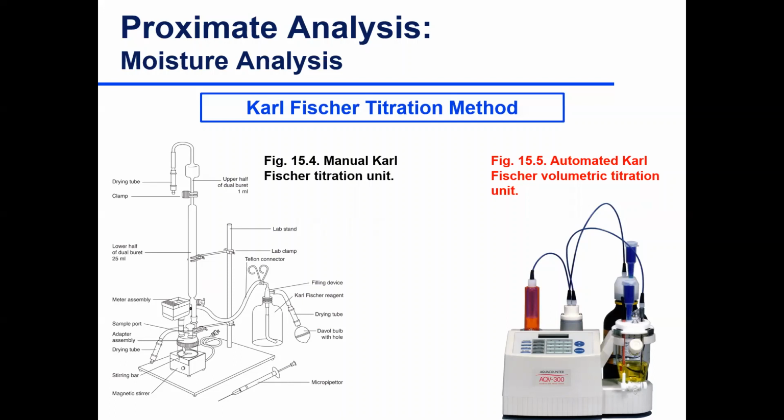If you go through something that's manual, it ends up being much more complicated, where you have your sample down here, you have your reagents in here, where you pump in your sample, get some mixing, and ultimately it gets titrated to come up with a moisture determination.